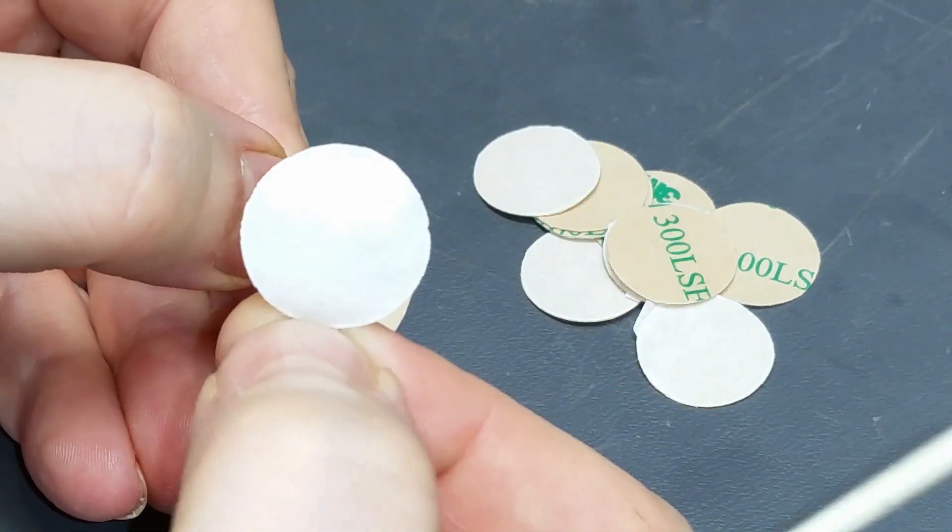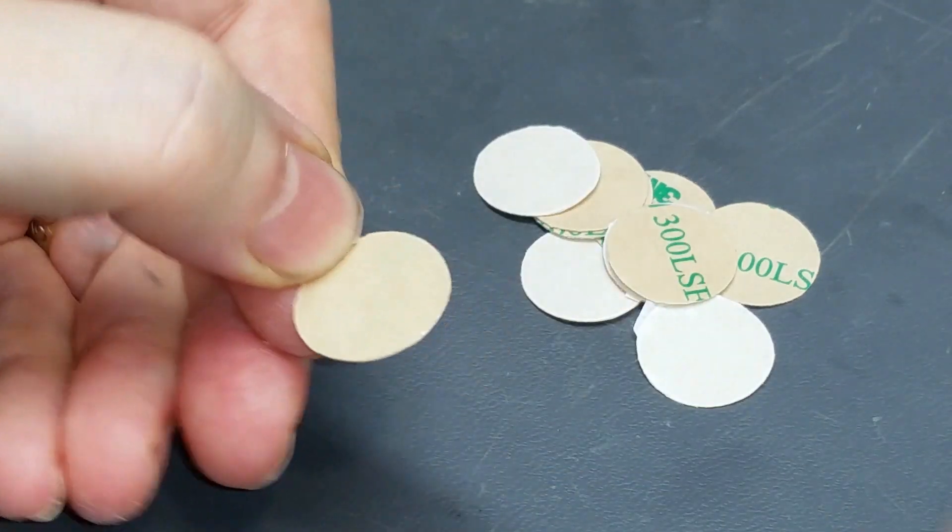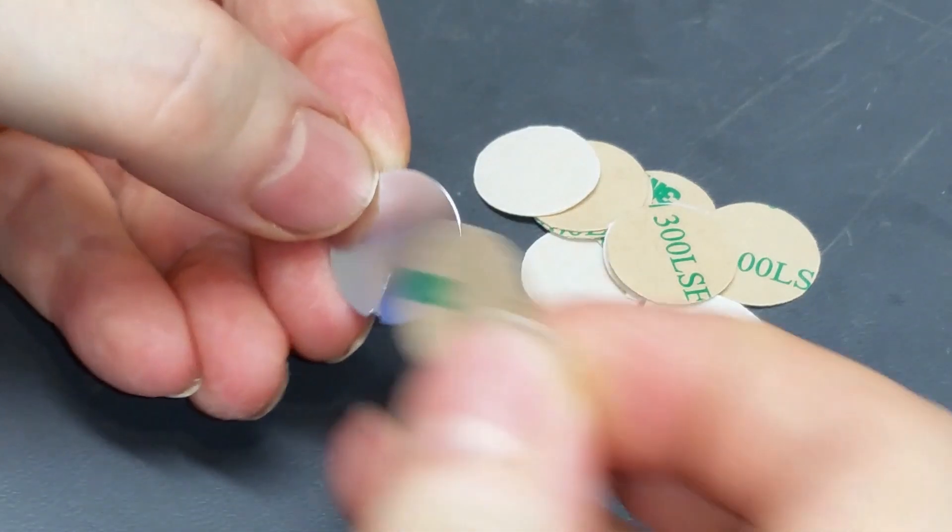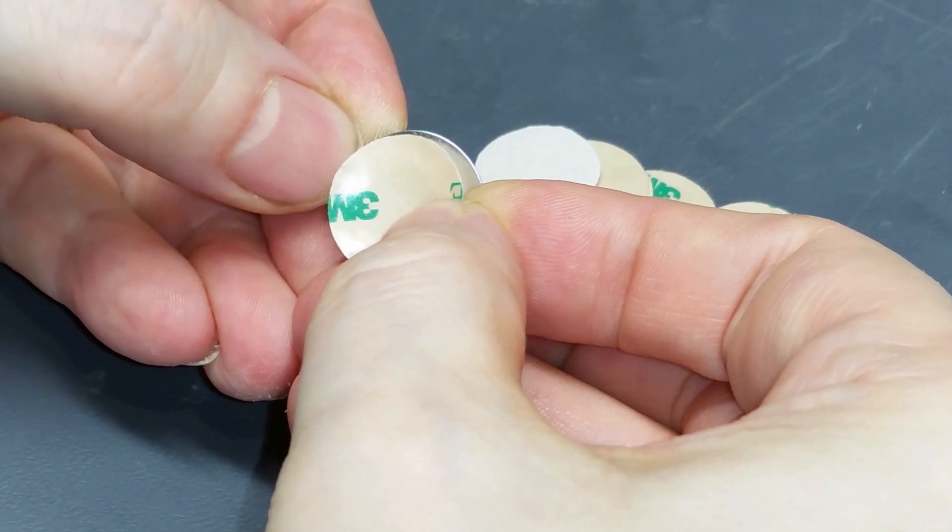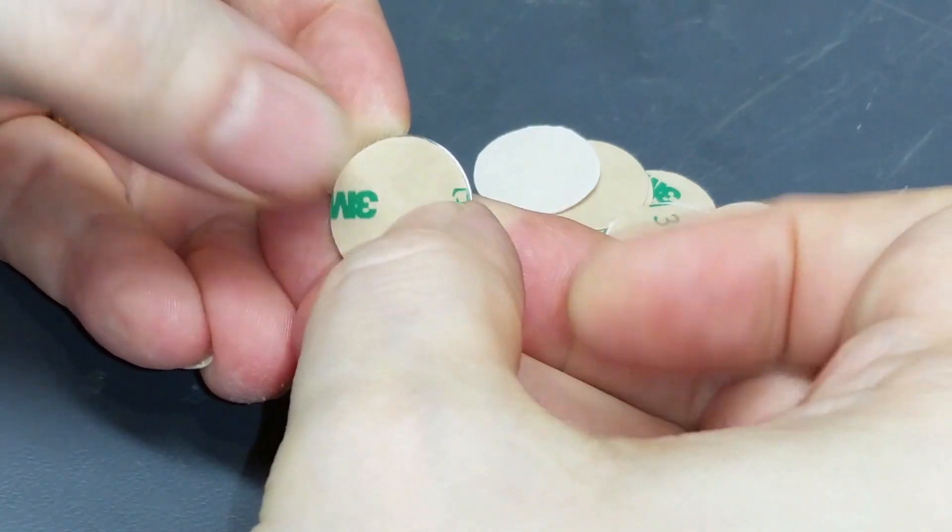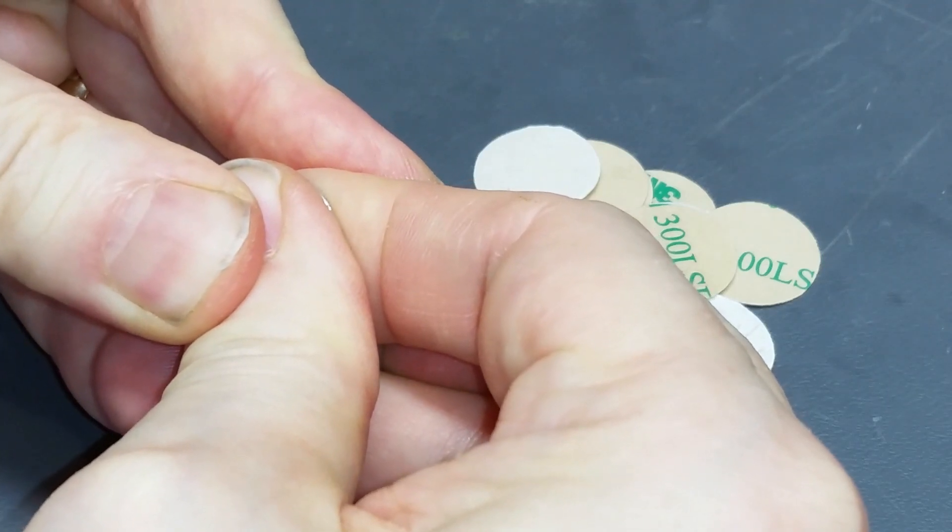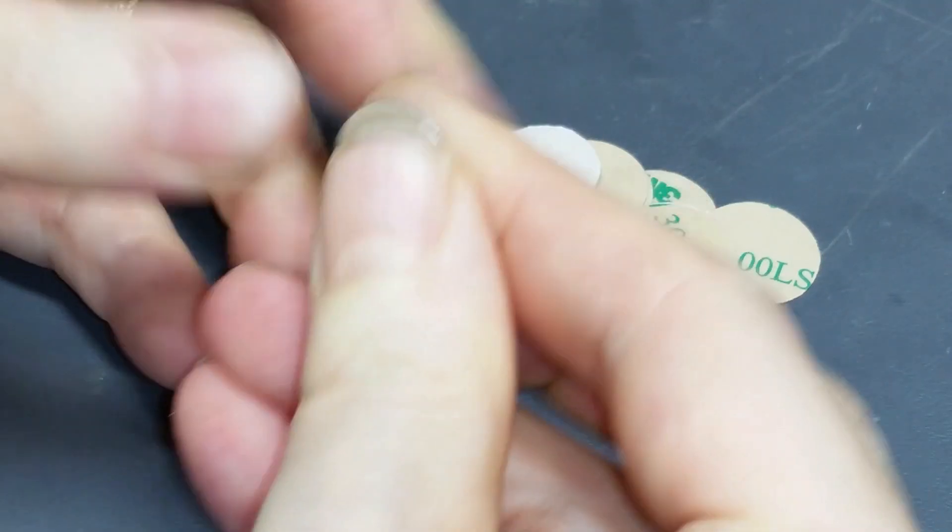So the protective tape came off. There's adhesive on this side. Now what I want to do is I want to line it up, stick it right on that side. Press it down for a few.